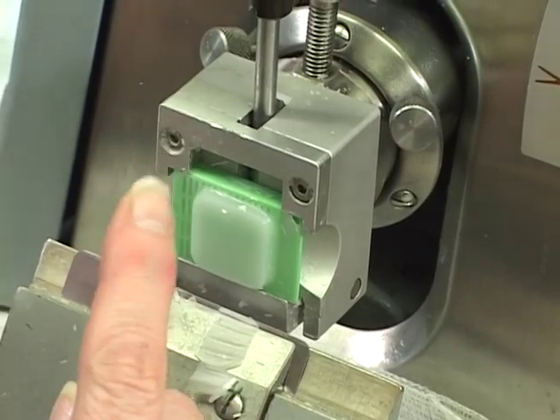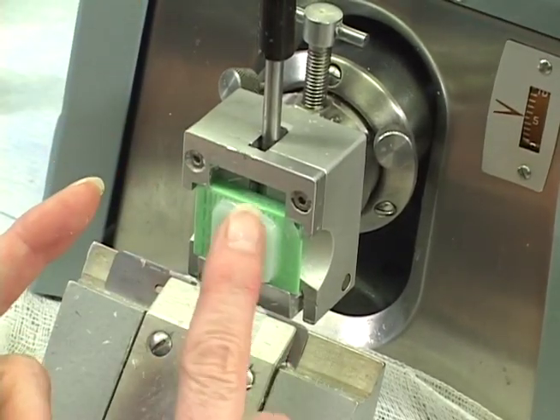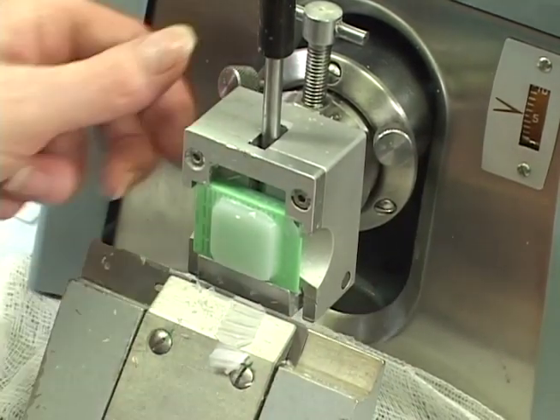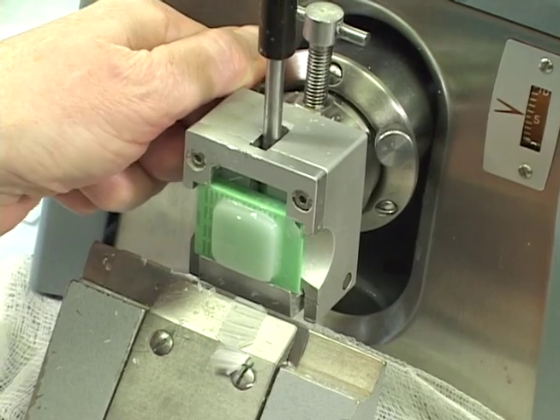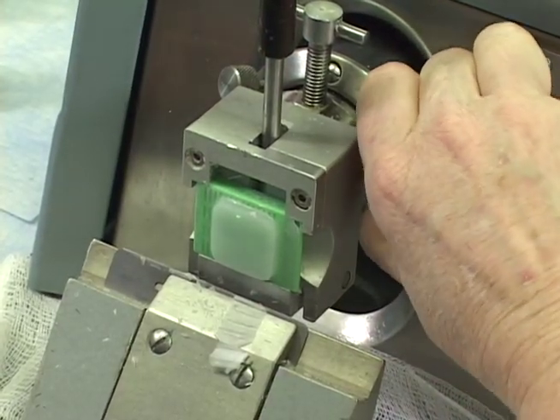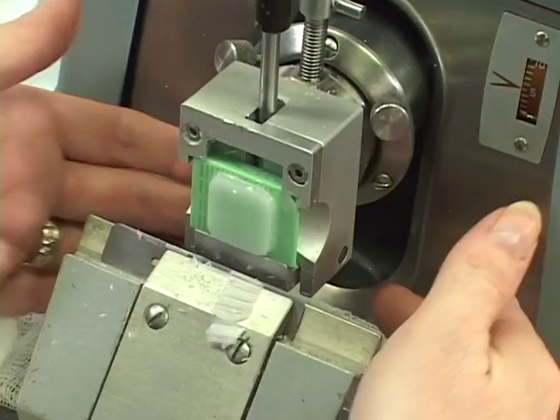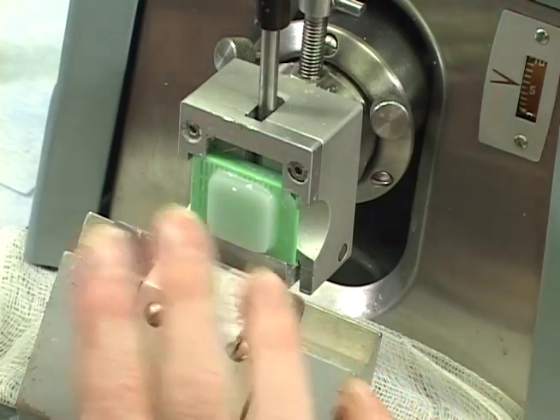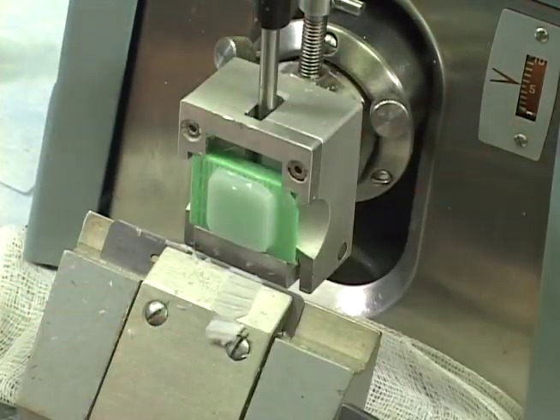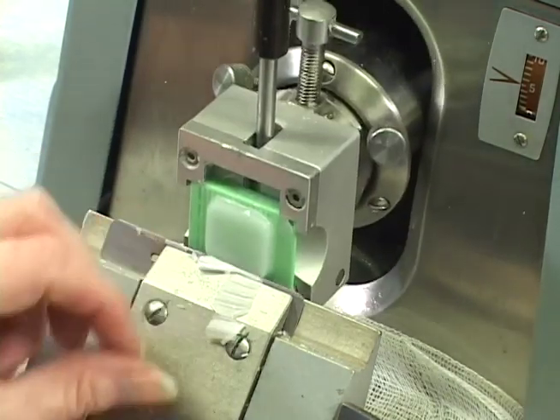So in this case, I want the tilt this side to come out a little more and that side to go back. So in order to get the left side out a little bit more, I'm going to loosen it one tiny bit, and I'm going to tighten it here. Now I can see from top to bottom it's cutting nice and even, so I don't need to do any adjustments there. I don't need to tilt it forward or back because it's giving me a nice straight ribbon that way. And that should have made the adjustment that I needed.